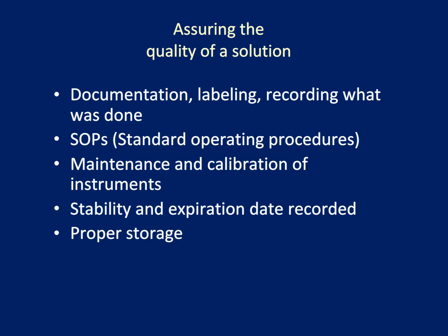Here are a few tips to assure the quality of the solutions that you make. Documentation, labeling, and recording what you have done is very important. It's important to document in your notebook and also to write with labeling tape on the glassware that you are using exactly what it is you are making. Be sure to use labeling tape. Please do not write directly on the glassware.